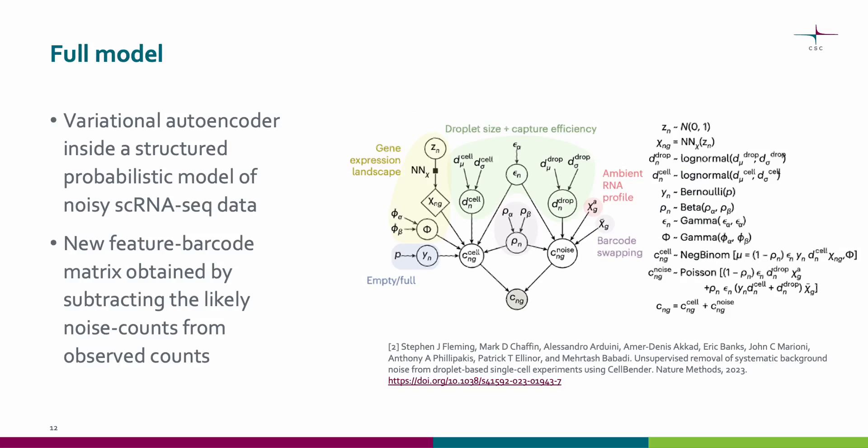Here is an illustration of the full model. CellBender takes into account steps in the data generation process, such as droplet size and capture efficiency. Here are the noise counts and here are the true cell UMI counts. Here is the neural network that determines the prior on true cell UMI counts. And here are the observed UMI counts. The estimated new feature barcode matrix is obtained by subtracting the likely noise counts from the observed counts.